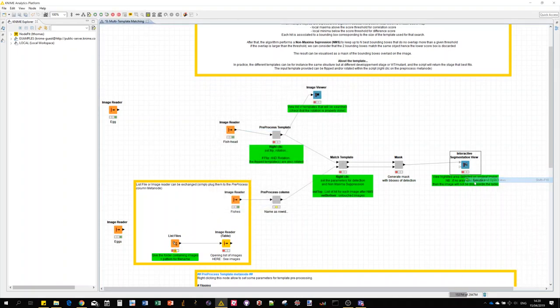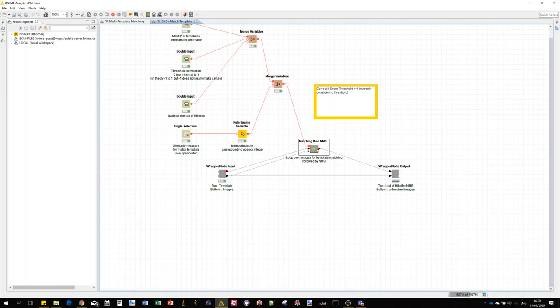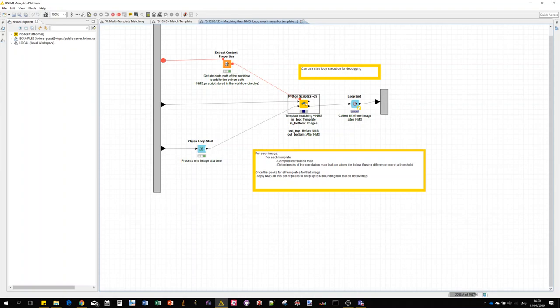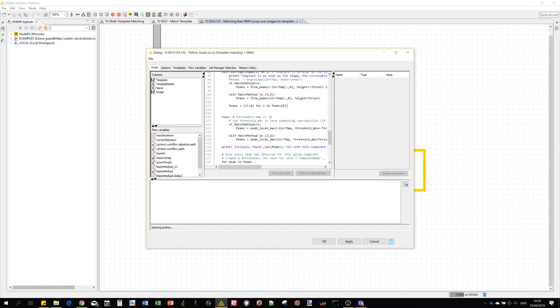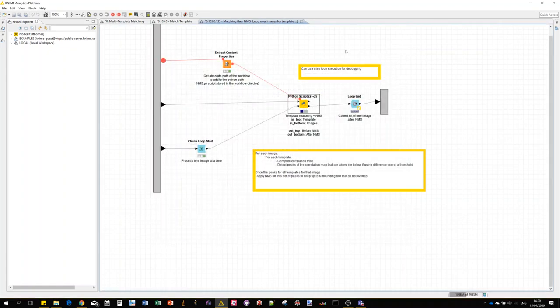Let's run it again. If you're a bit curious, you can also enter the meta nodes. You see a first kind of layer which here is defining the graphical user interface, and inside this other wrap node you can see that the processing is actually performed by this Python node. You can actually even look at the source code which is simple Python code.